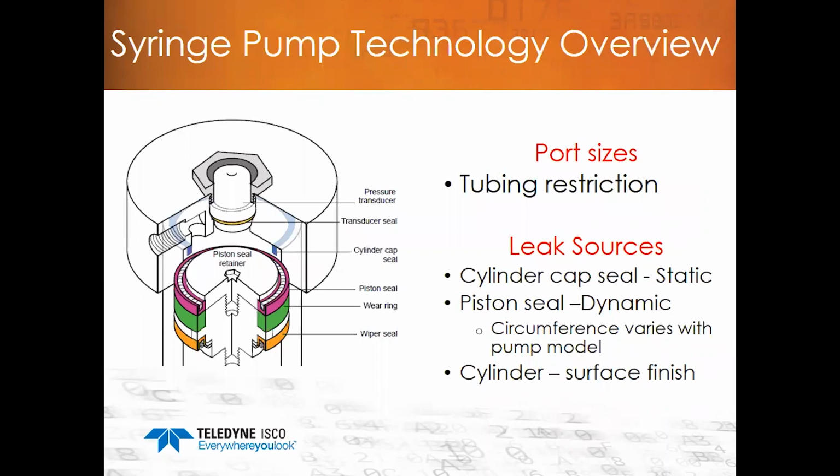The cylinder can also cause leaks because of its surface finish. Even though the seal may be in good condition, leakage can occur if the surface finish has become damaged or scratched.